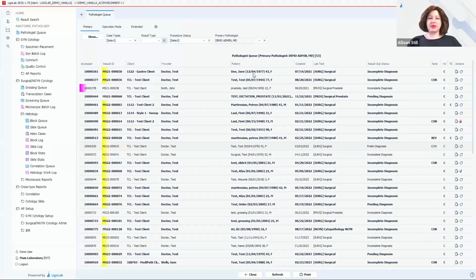For example, let's say you want to split out patient name and patient date of birth into separate columns, or we want, I don't know, the pathologist name as a column. Anything like that really could be added with this feature, and each user can have their own unique presentation if someone really wants to see that information and other people don't. Yeah, so I'll go ahead and open our case here.